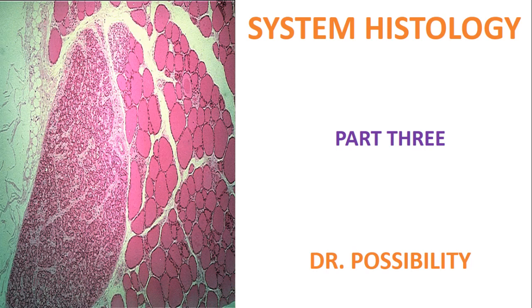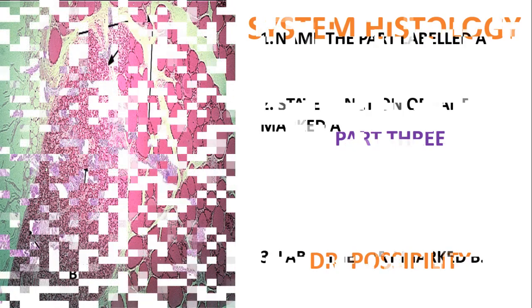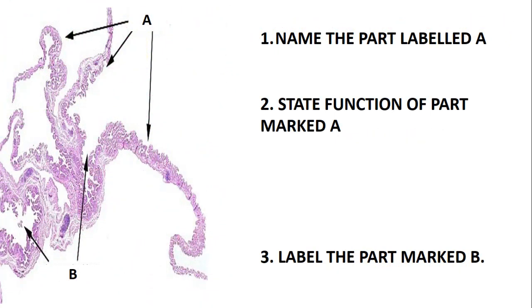Make sure that you register with Excel Academy. Let's quickly look at some questions and slides. The first question is: name the part labeled A. So if you look at this part, this slide is just a part of the fallopian tube, and the part labeled A is just the fimbria.